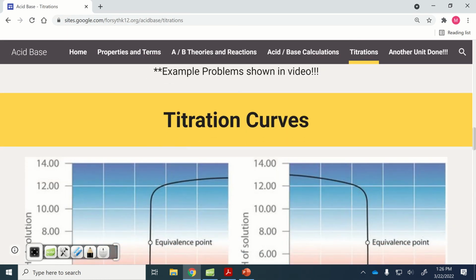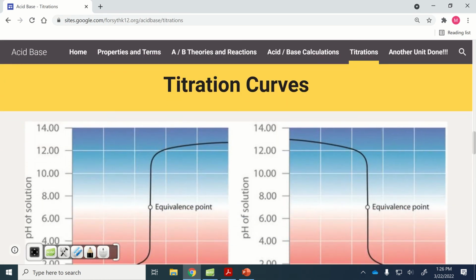That's all the math. All we have to look at now are these things called titration curves. All right, so what we're going to be doing here is we could try to create a titration curve if we have some good equipment with this, where we would need conductivity testers that would actually help us with this, and pH readers to make sure that we are reaching particular pHs at particular times.